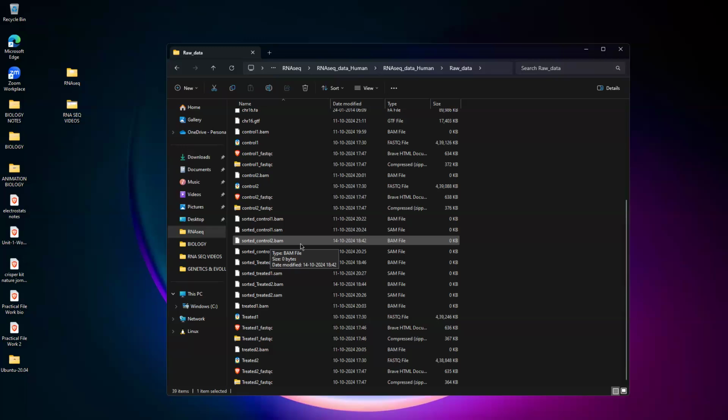So how did you perform? It was giving an error while running the commands. Somewhere in between you performed a wrong step, because you can see 0 KB for the files. That means there is no data, and that's the reason it is not creating any transcript file.